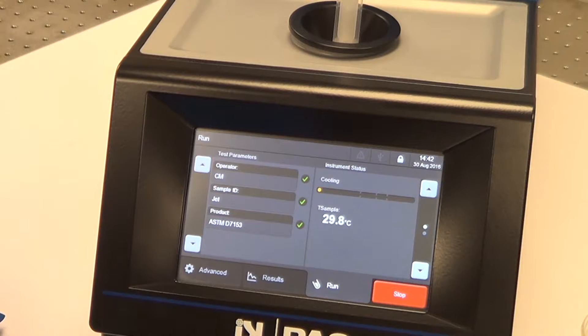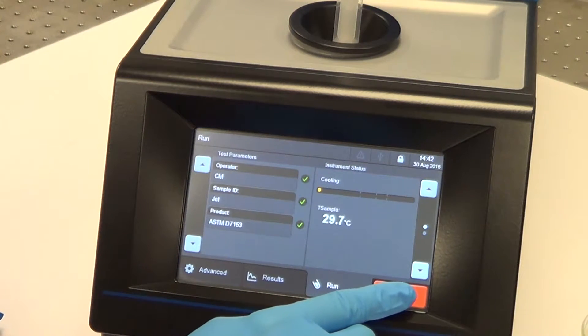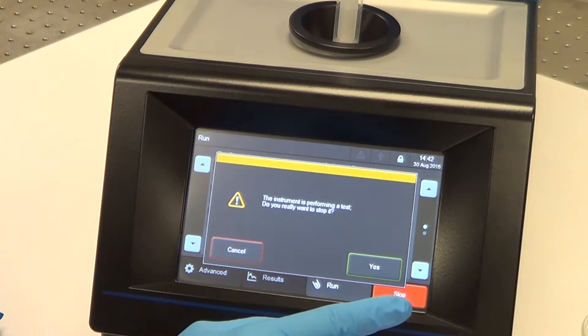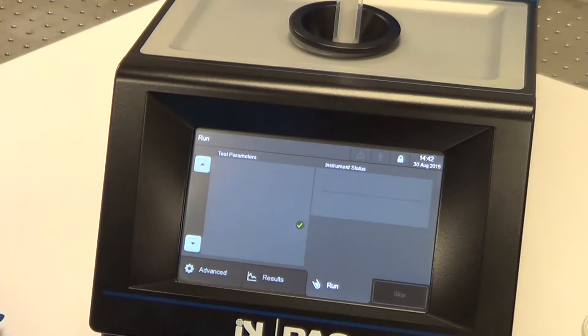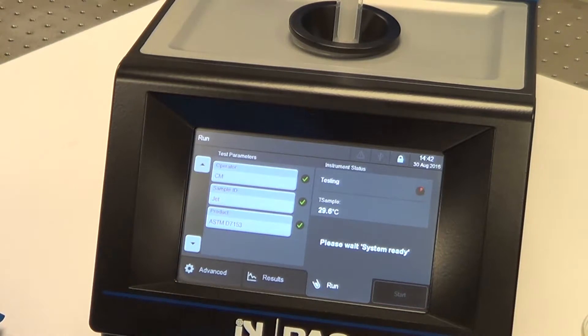If you wish to abort the test for some reason — say you realize you put the wrong sample in — no problem, just hit stop and yes, and it will abort the test.